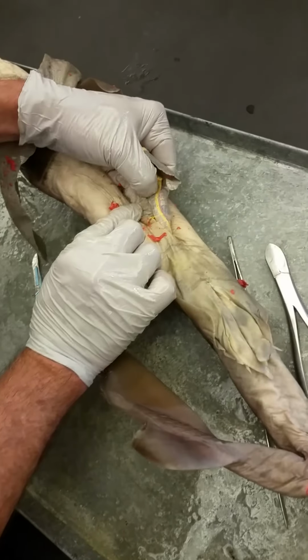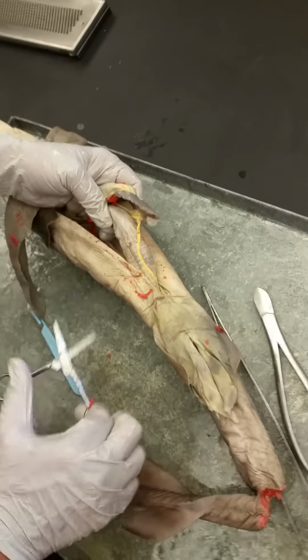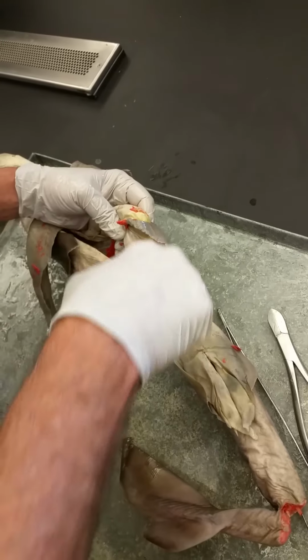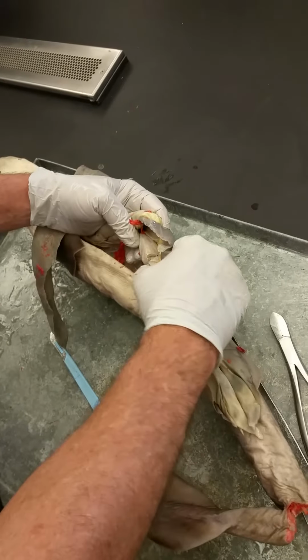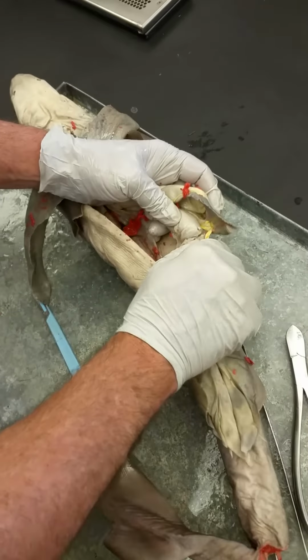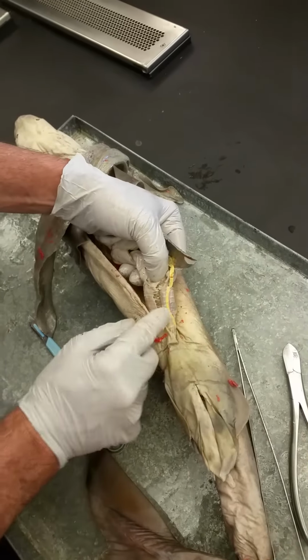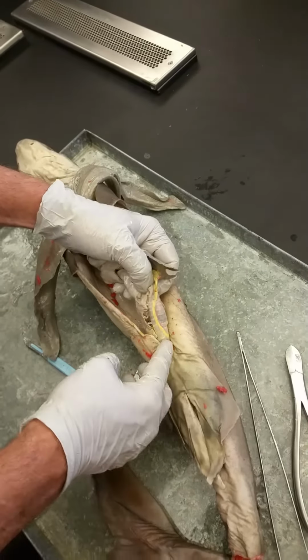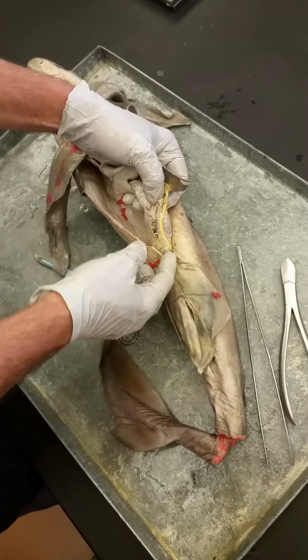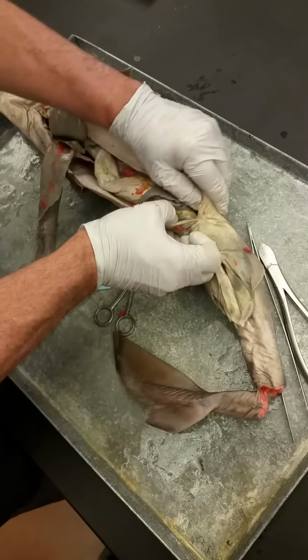Get it to spread a little bit here. I have to expand it a little bit more. There we go. These ridges inside here make the path of food through the intestine travel this long pathway down the intestine. So again, instead of having a long gut, the spiral valve is a unique structure only found in sharks. And then back here by the anus, I'm going to cut back far enough.